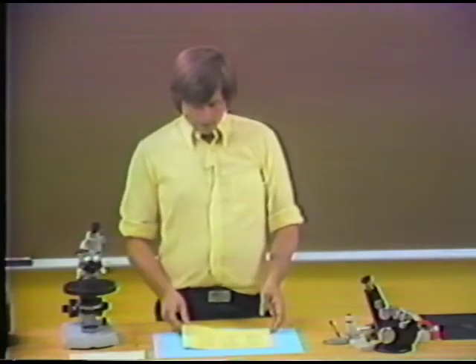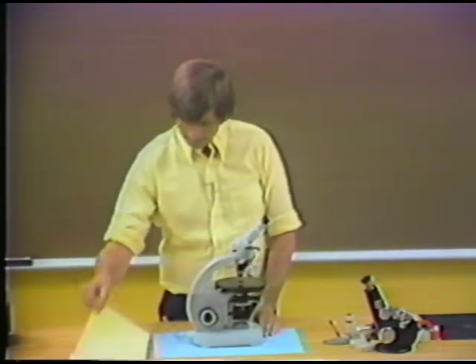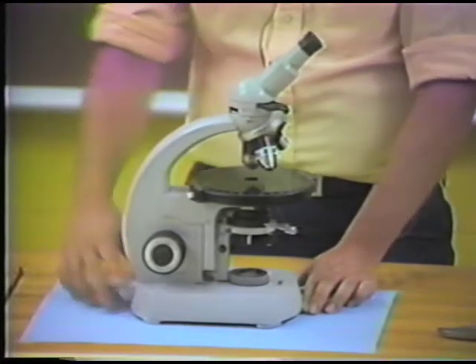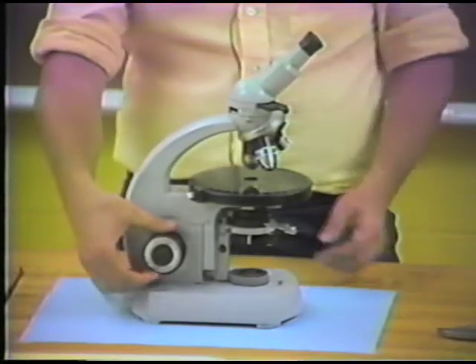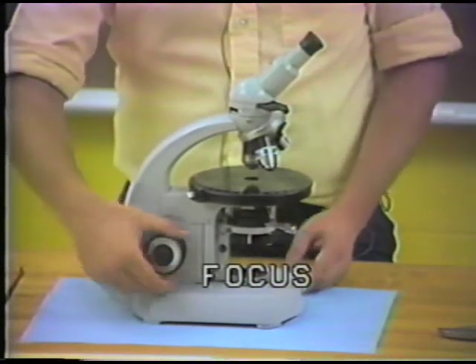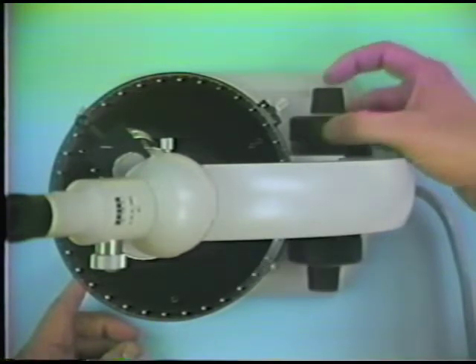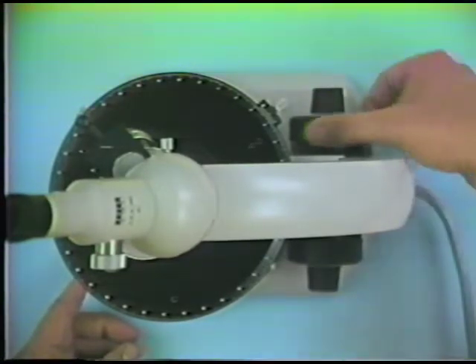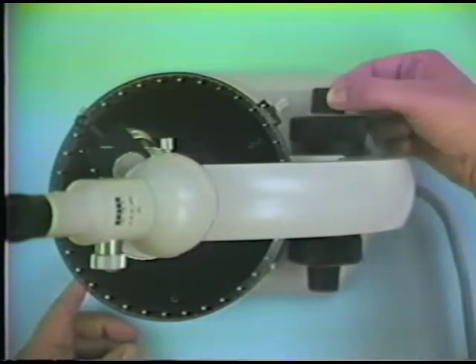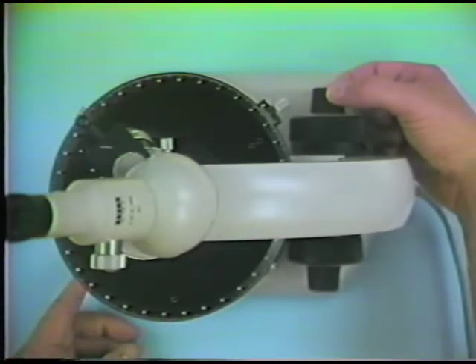Okay, I'll look back again at the microscope and go to the next portion of the microscope that concerns us, and this is the actual focusing adjustment. The focusing is controlled on the microscope by physical movement, in this particular case, of these knobs. There's a rough focus, which makes a very strong movement, and there's a fine focus knob, which adjusts the level of the stage very slightly.